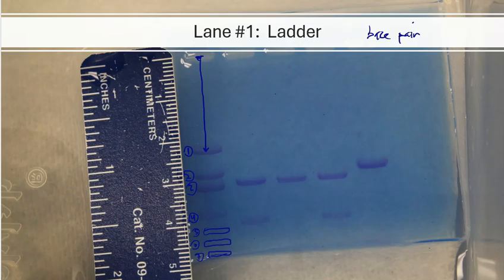Does destaining help with this process? Yeah, it does sometimes, but actually just having a proper camera with a very bright white light background will make these show up even more so, especially with a camera and a document station that we do not have currently in ChemTech, but hopefully sooner or later down the road we'll get one.